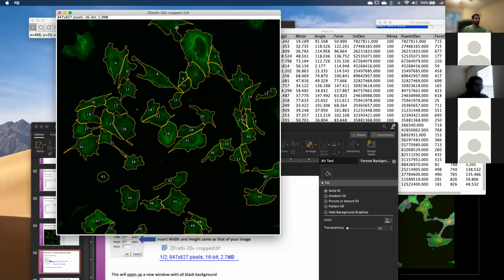And again, a point that I want to make is compared to last time where we did the whole thresholding based masking for the cell, which was very cumbersome, very painful, this is straightforward, less painful, gives you a ton of data instantly. And we haven't even trained a model. We are using a pre-trained model to generate these cells, okay?